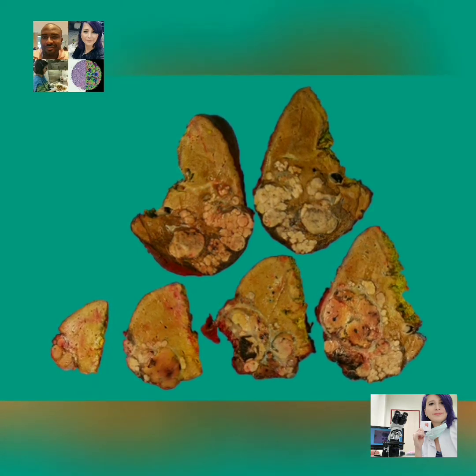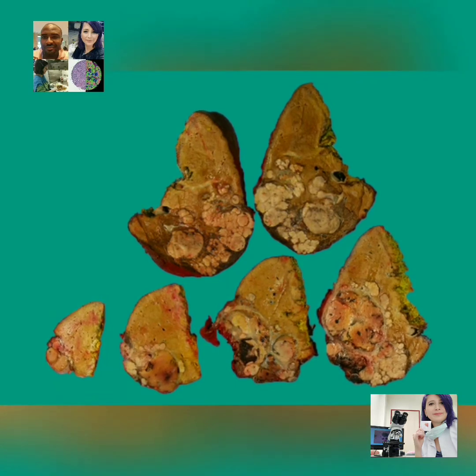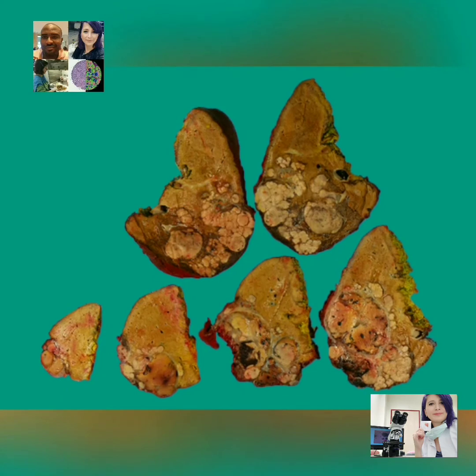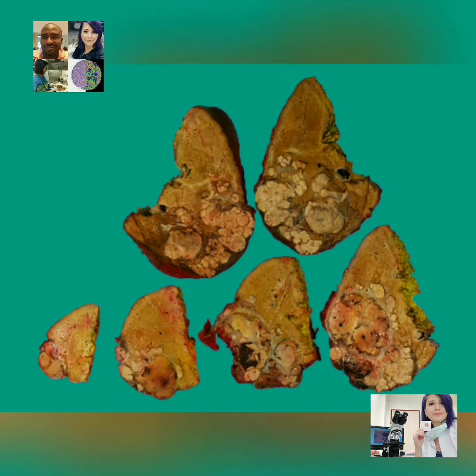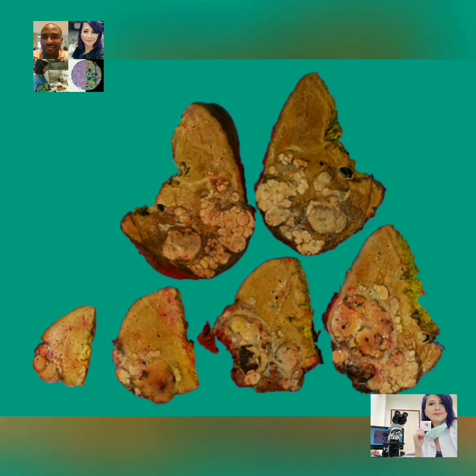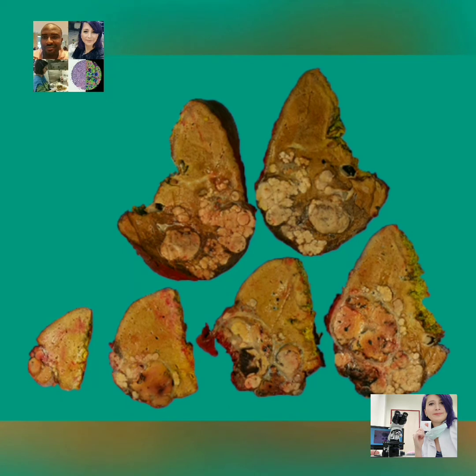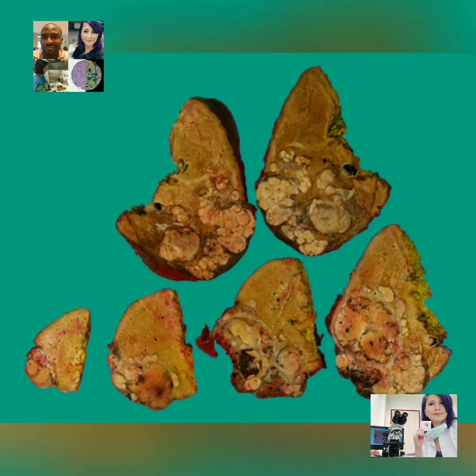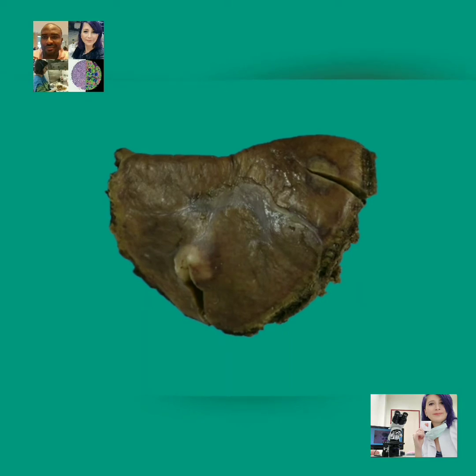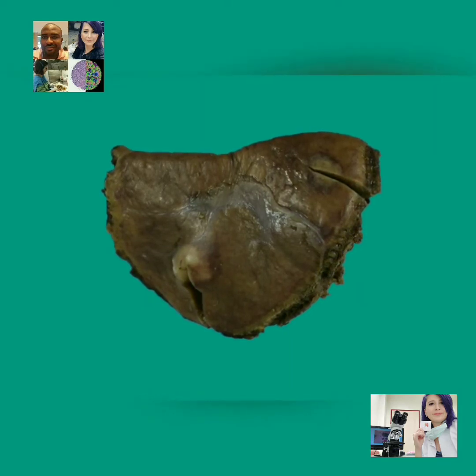The first image shows a resected, enlarged, diseased liver. The gleaming capsular surface has been breached by multiple grayish-white tumors. The anatomy is partly distorted by these nodular masses. The second image shows an apparently unremarkable liver tissue with the gleaming capsule intact, while the third image shows a shrunken cirrhotic liver with multiple micronodules.